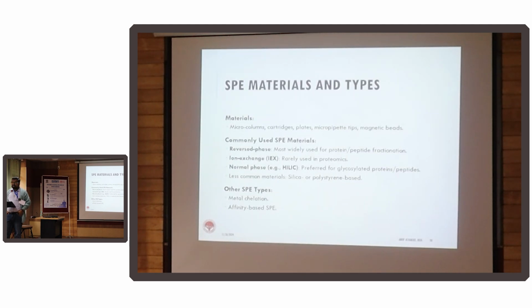And you will have liquid handlers and robotics to assist you. So big labs that process lots of clinical samples use automated liquid handlers and plate format desalting methods by which they can get very clean peptides without any issues, and it's completely automated.